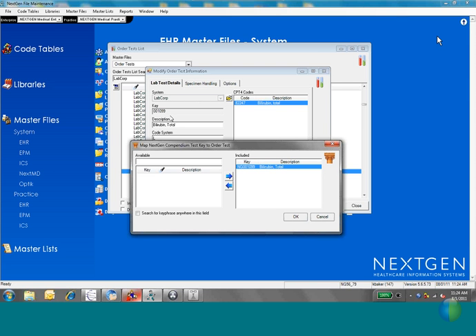And again, the reason I'm doing this is because I wish to place an order from the 7.9 lab template, or I have multiple vendors that I work with, and instead of having multiple vendors listed and having all these different tests separated out by vendor, I'm linking them together to the NextGen test so that I can create a universal test list. So again, those two situations are the reasons you're going to do this here.